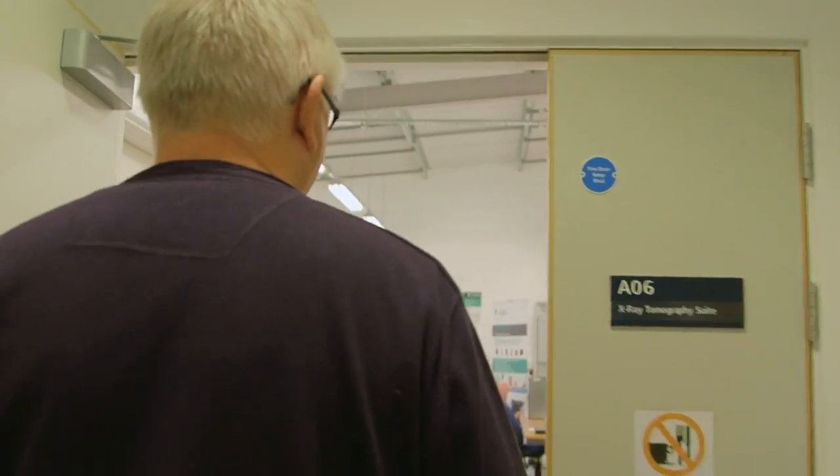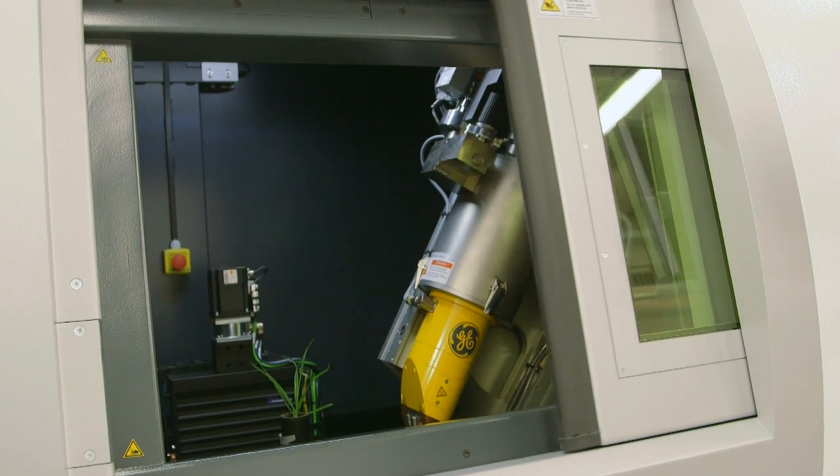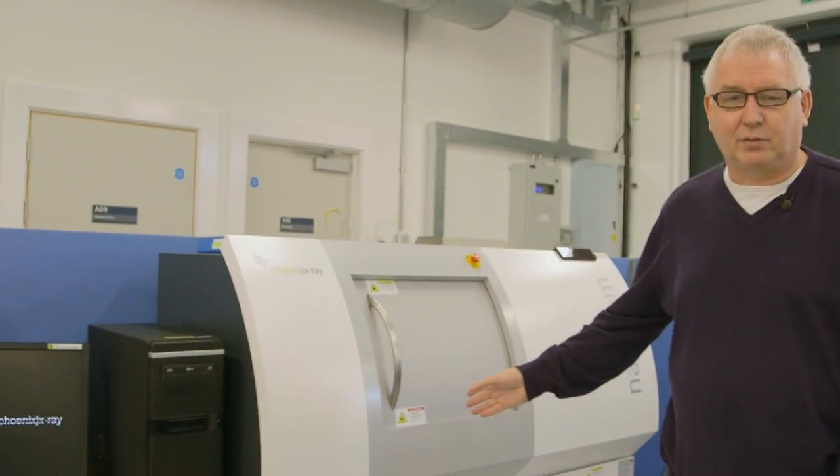This is the main part of the building that houses a set of three x-ray scanners, like medical scanners but higher resolution. They differ only in that the sample rotates and the x-ray emitter and detector stays still, whereas in a hospital they would spin around the patient. There are three different sizes; this is our original one, which will take samples about the size of a Coca-Cola can and do very high resolution images. All of them produce a three-dimensional image of the sample in which each voxel value — the voxel being a three-dimensional pixel — measures the density of the material at that point. Air has a much lower density than bone, and so on.